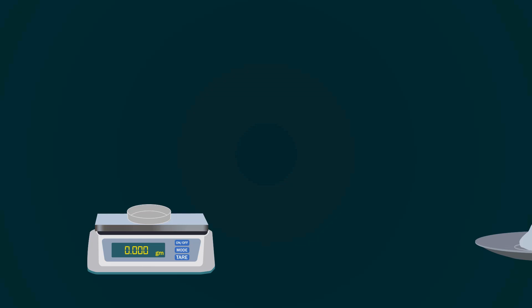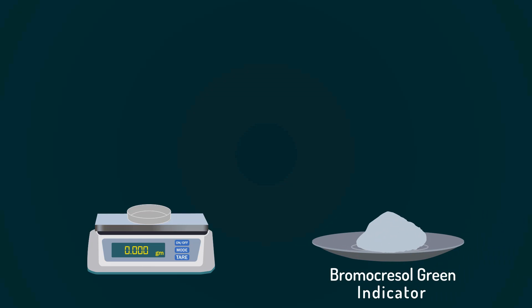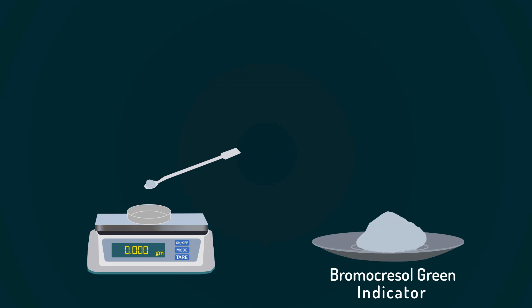First of all, take a weight balance and power it on. Now, put a Petri dish on it. Don't forget to tare it down. Now, add Bromocresol Green Powder into the Petri dish with the help of a spatula. Weight precisely up to 0.1 grams.